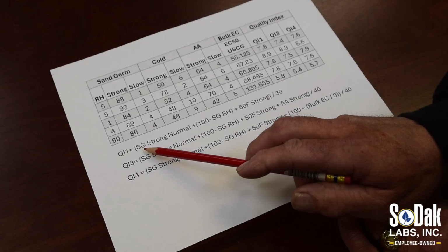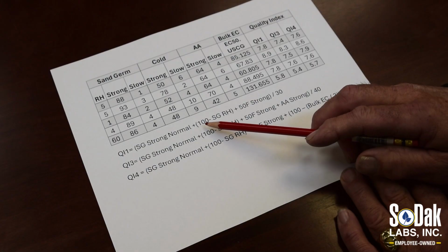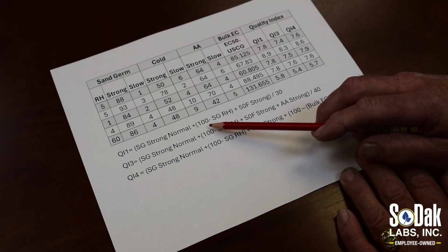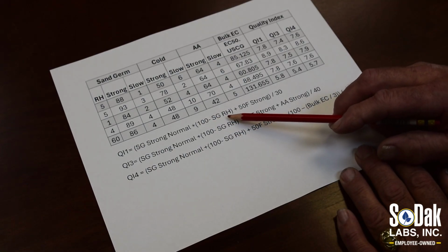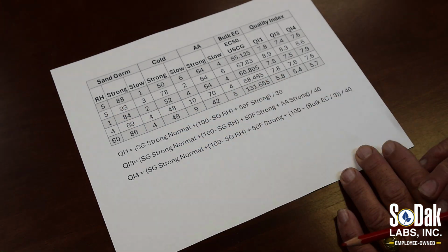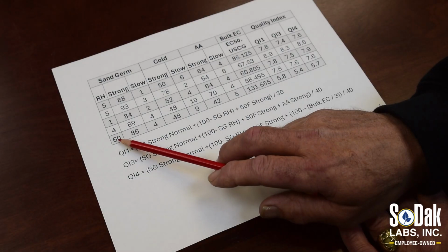So we're using, from the sand germ, strong normals, plus we do this sort of conversion of the rhizopus mycelium rating. We take 100 is a great number in an index, and we subtract the amount of rhizopus from the rating. So you see here you get a 95. So no rhizopus is supposedly showing no sugar leakage. Down here, when you have a lot of rhizopus, then we're showing a lot of sugar leakage.